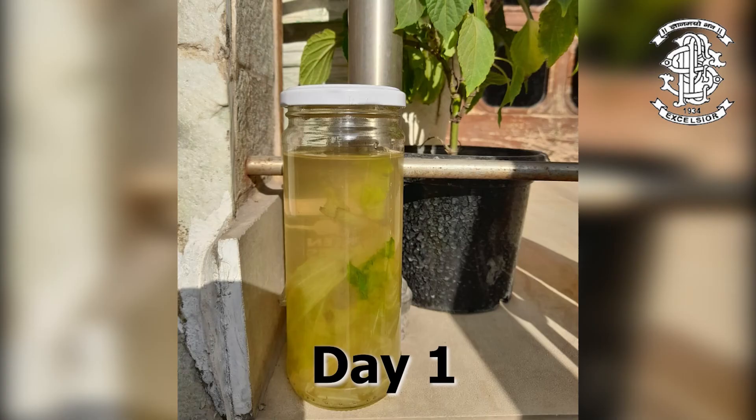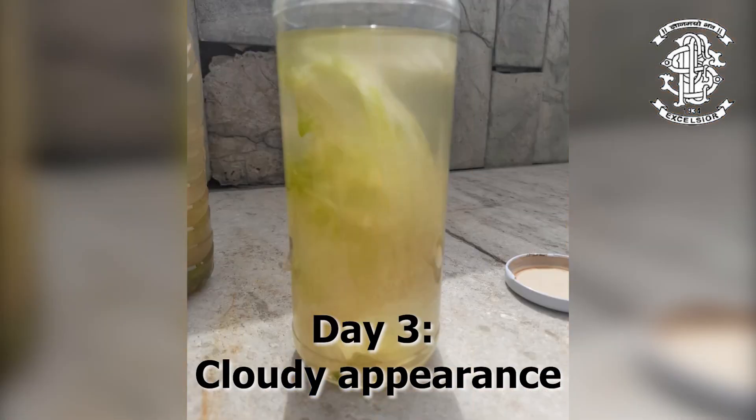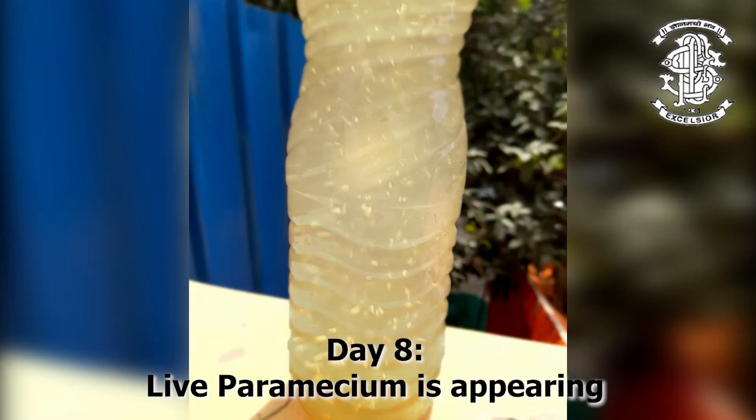There should be a bacterial bloom initially. After a week, the paramecium should show up, before which it does show a cloudy appearance. To keep the colony fresh, add a small amount of cat food, milk, or fish food. I chose to add fish food. Paramecium should spawn in the nutrient-rich water.